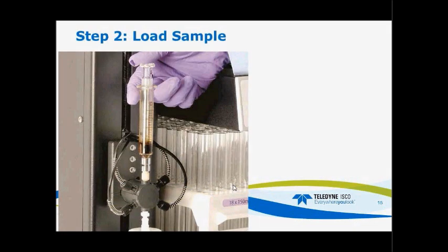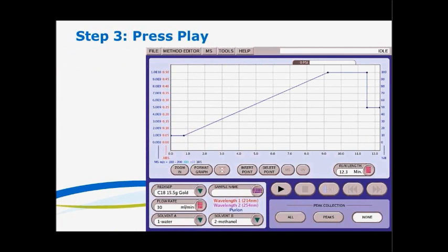So I mentioned step 2, simply load the sample. You can do this as shown here with a liquid load, or you can use a solid load cartridge, whichever your preference is. And the final step is simply to press the play button down below.